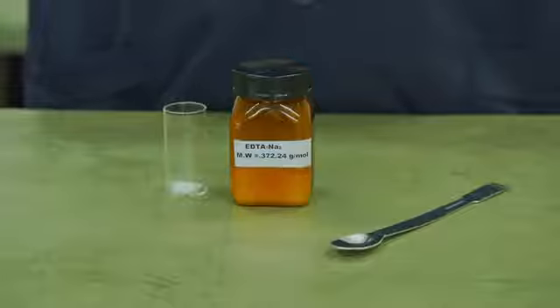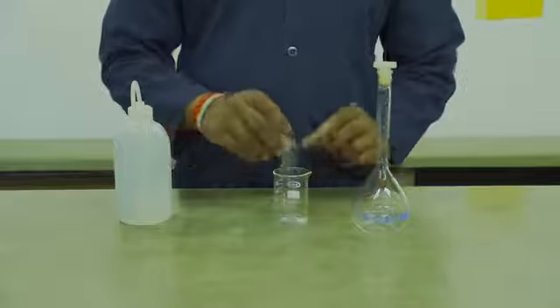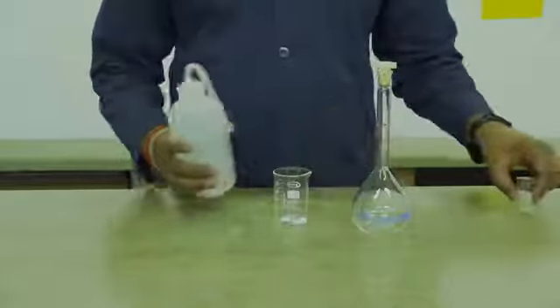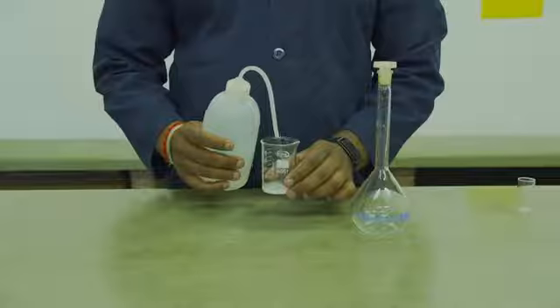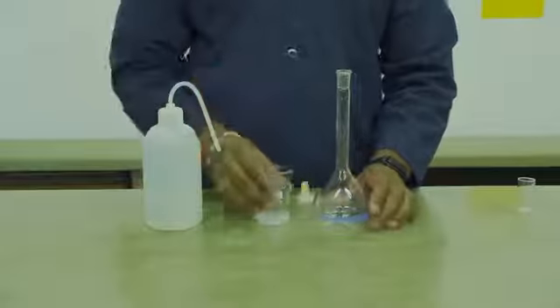As demonstrated in A1, you will weigh out 0.46 grams of EDTA by difference. You will then transfer your EDTA powder into a beaker and dissolve it with some deionized water. Ensure that the water is deionized as your sample is tap water.